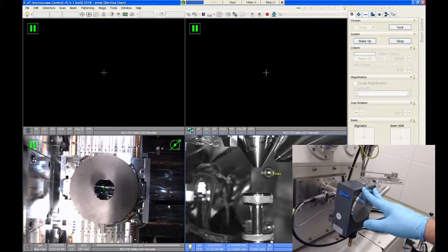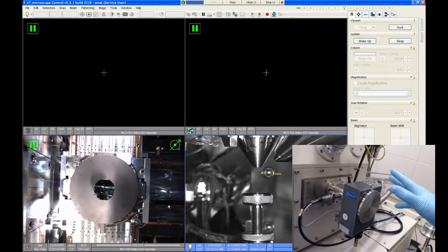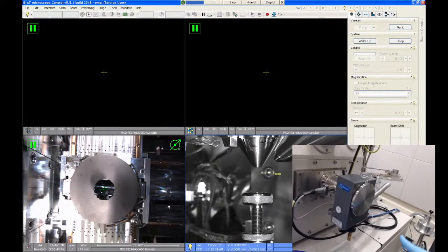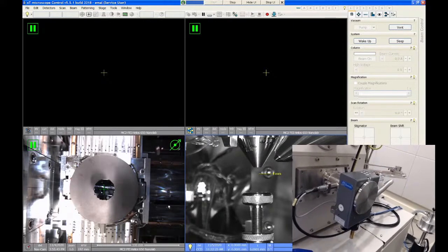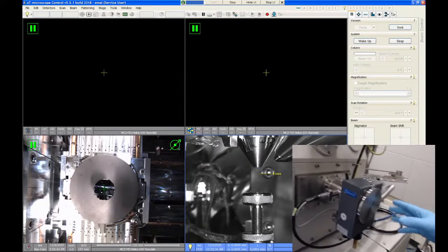Cryogenic milling is done a lot on biological samples or soft materials like some polymer samples. You can sometimes get better cut quality if you mill through them when they're cold compared to room temperature, because the FIB tends to cause some heat buildup and it can melt or damage structures. So the cryo stage helps with some of that. So that's a neat accessory we have here.